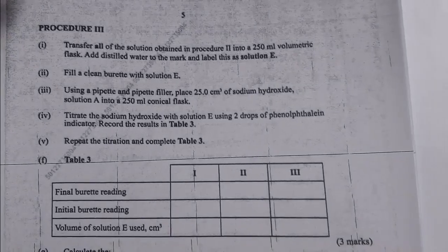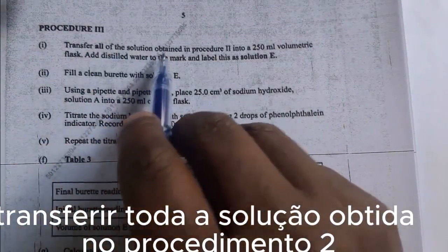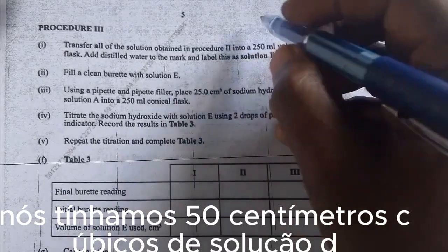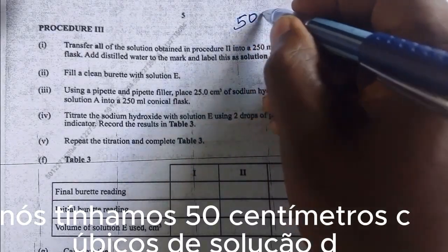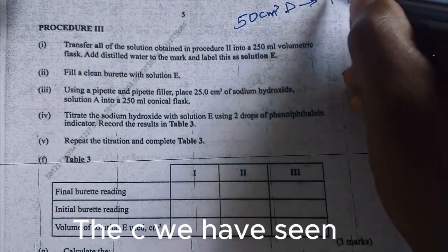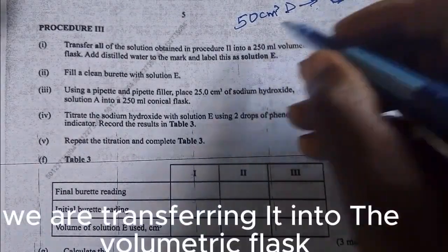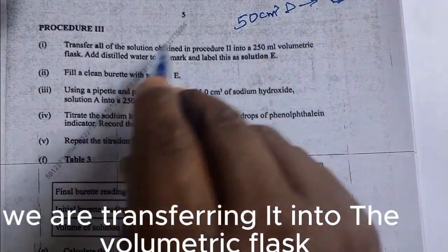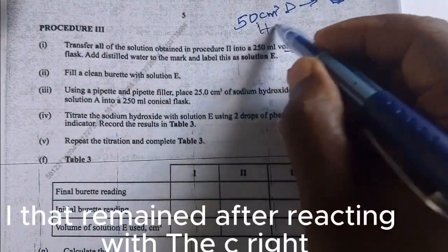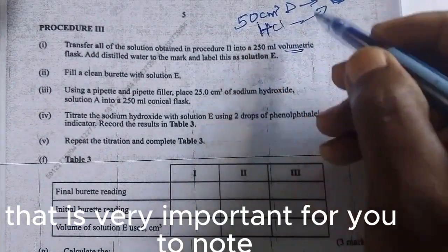Procedure 3. Transfer all the solution obtained in procedure 2. Now remember the solution we have left here, we had 50 centimeters cube of solution D. This has reacted with C. We have seen the way we have done it. Now the solution, we are transferring it into the volumetric flask. So we are transferring HCl that remained after reacting with C. That is very important for you to note.